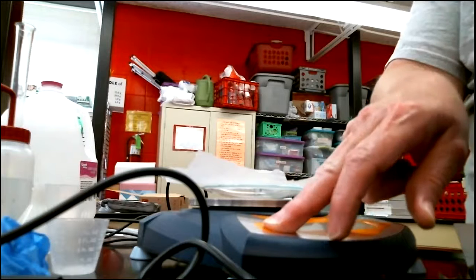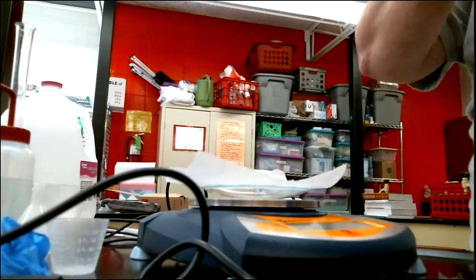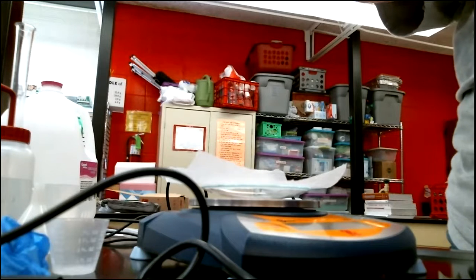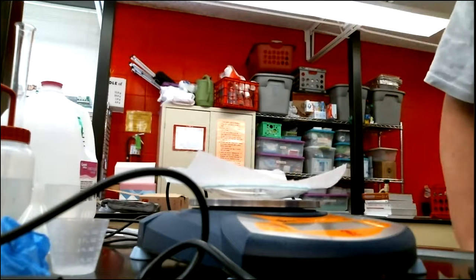So I'm going to zero the balance. Okay, it's gone to zero, and I need 60.18 grams. I'm going to take some Epsom salt.